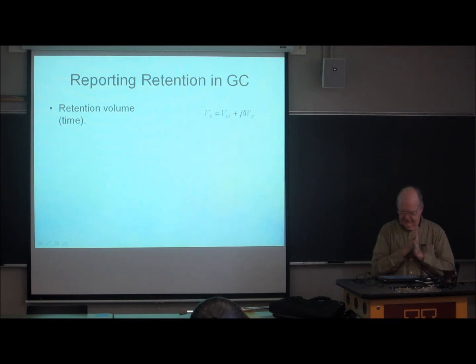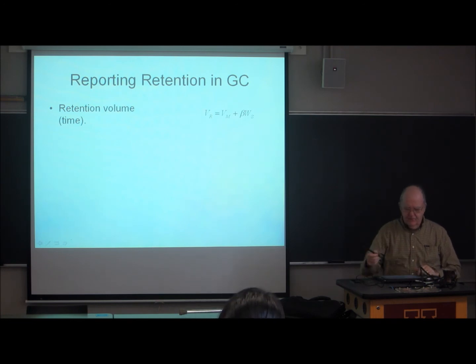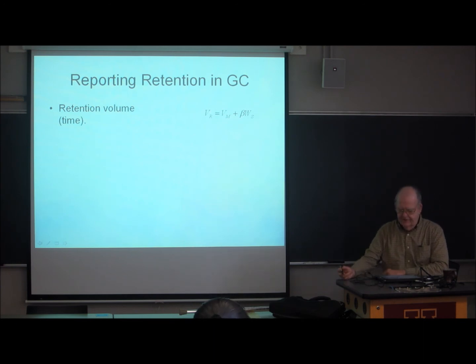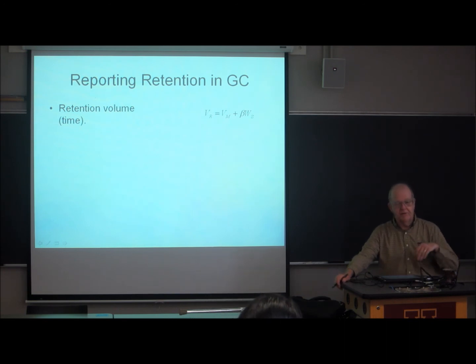Okay, so sort of the end of the practical stuff for now. Well, reporting retention is also a practical issue. And it turns out that gas chromatography is much more complicated than liquid chromatography in terms of how we have to report retention. And I'll get into the reasons why that is so later.